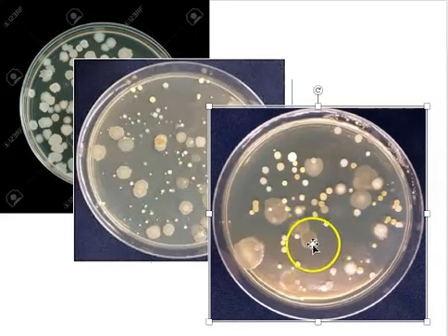That I can be sure of. What I can't say is that all of the small white colonies on this plate come from the same organism, because there may be two or more organisms that grow as small white colonies.